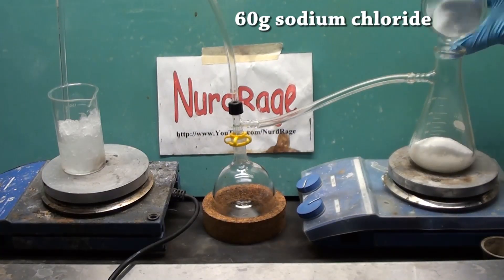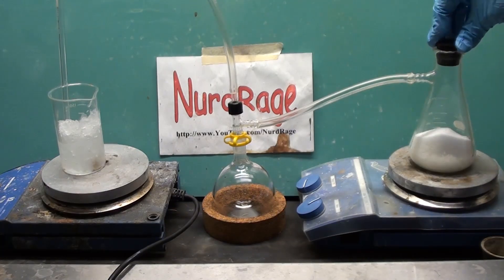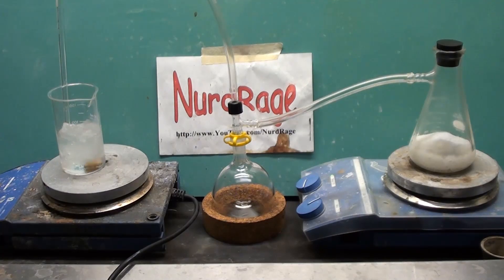Now you add in 60g of sodium chloride table salt. I should have mixed the two chemicals first, but you get the idea — be sure to mix them yourself if you try this. Stopper the generator and then turn on the heating. What's happening is the sodium bisulfate and sodium chloride react to form hydrogen chloride gas. This gas travels through the tubing and dissolves in the water to form hydrochloric acid.